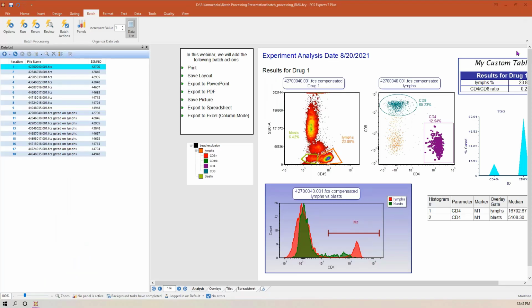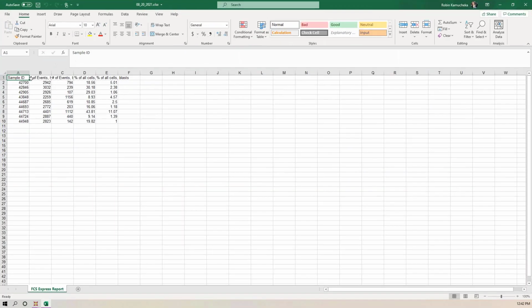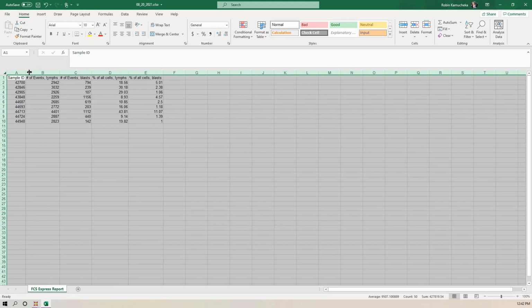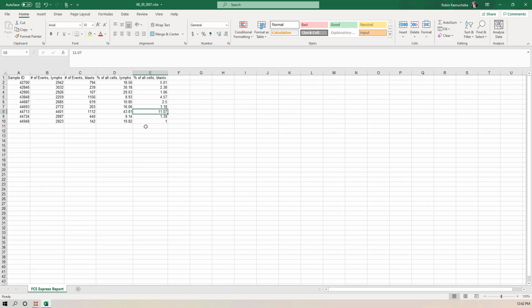Now I'm going to pull over the Excel sheet. So our external Excel sheet was pretty small. We created this Excel sheet here. It's going to work just as if I created this from the start in Excel. So any of the things that I want to do or continue doing here, I can just work as if I had started in Excel here. As you can see, that sample ID label that I had changed is input here for that row label, which turned out really nice. Again, I have this, I can start moving forward. I don't have to recreate any elements here.